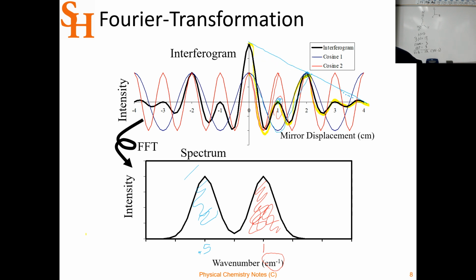And it makes it go smoothly to 0. Because if the interferogram doesn't go smoothly to 0, you get some spectral problems. The peaks bounce at the bottom. They're called feet. The peaks have feet. And so that's called chopping the feet off, or apodization. Apod, no feet. And so that's as far as we're going to get. But that'll tell you what's going on in the interferogram and the Fourier transform instrument.